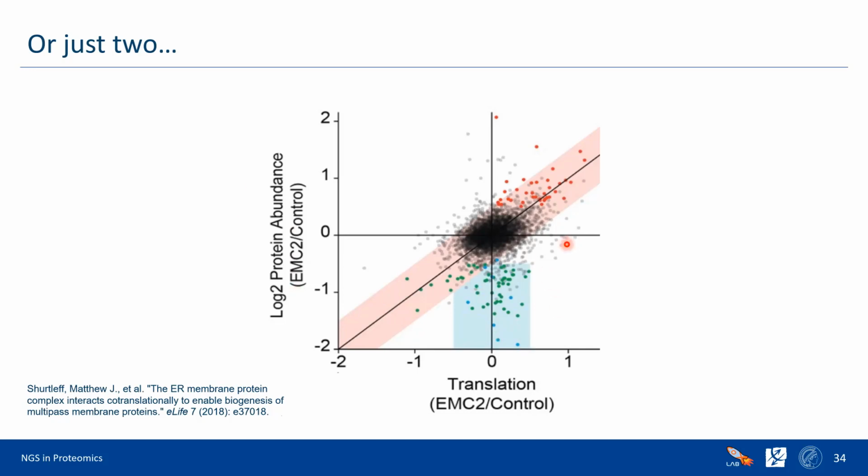We have several groups, and we made a big follow-up on each group. But let's, for example, focus on these green-blue dots. As you see, for these proteins, translation hasn't changed at all. But what changed is the protein abundance, which we see with proteomics. And that's really cool. This means that these proteins are expressed and translated, but while there's no chaperone to bring them to shape, they are directed to degradation. That's actually a very beautiful story, I think.